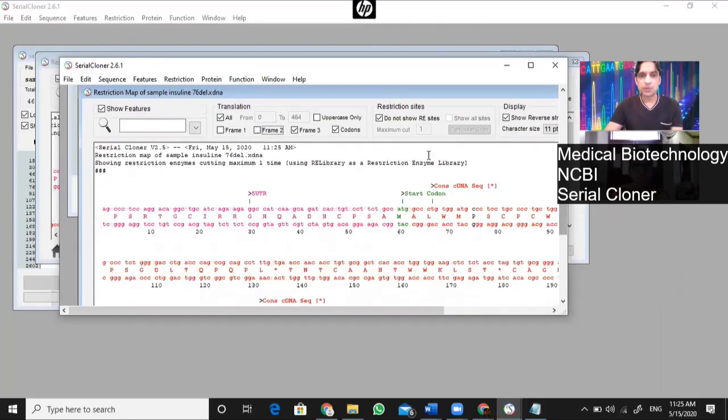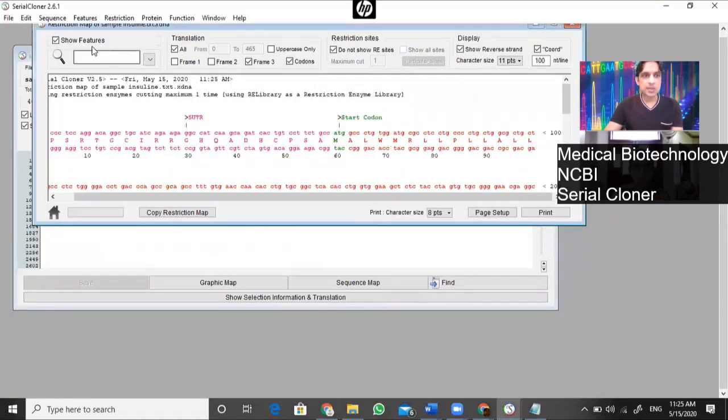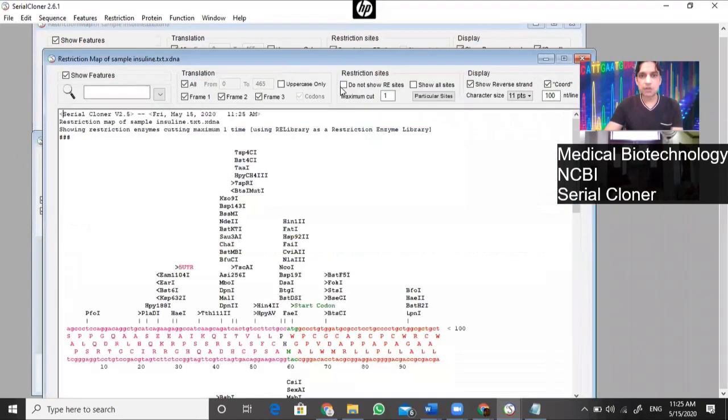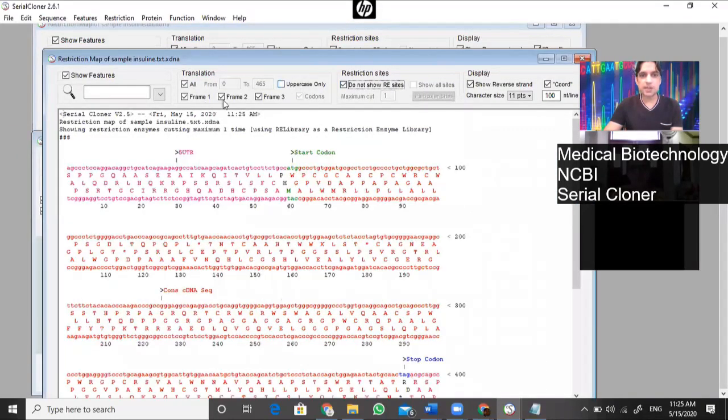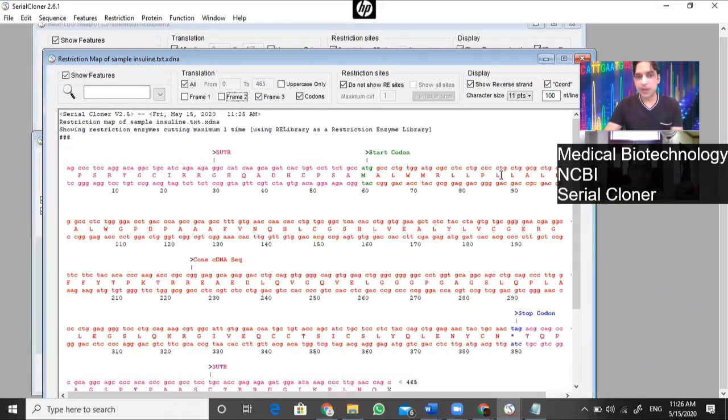Above one is the file for the wild type. Actually, when I shift the files, it changes the sequence. Just try to use your memory to remember. This is the file for the wild type. MALWM, and then there is RLLP. And after that, there is no stop codon until the wild type stop codon came.